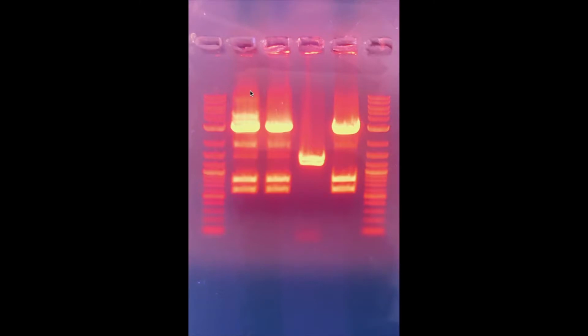These 3 lanes are my no name plasmid cut with ASE1. I should get 3 bands here, 1, 2, 3, but instead I'm getting 5 bands. So what's the issue with these bands that appear between my desired bands? First of all, I didn't know.